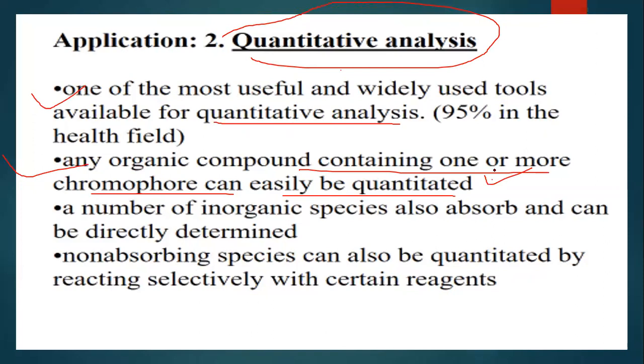But there should be the presence of a chromophore. There should be the presence of a chromophore in the organic compound.